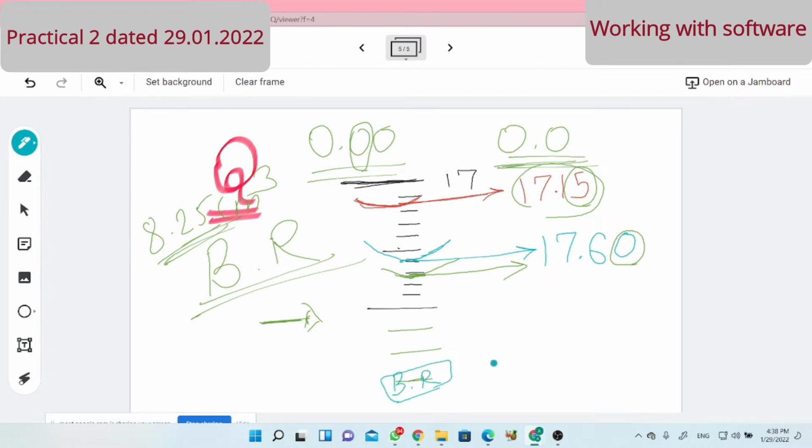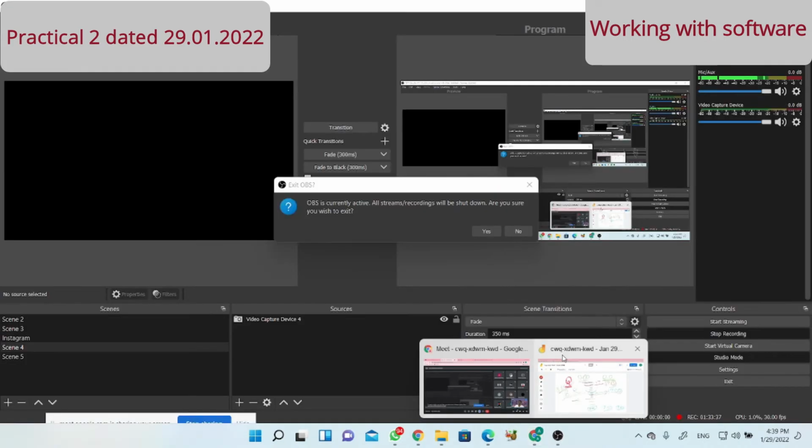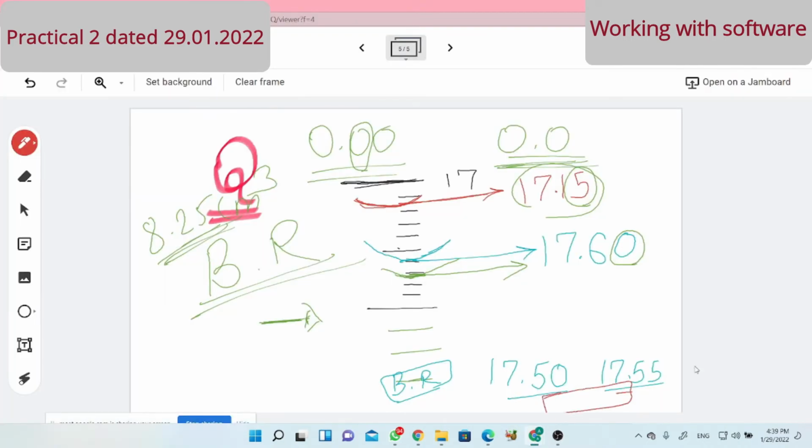If that difference for the student, the difference were 17.3, example, just wait, what was there? Just another example I can take. Say 17.50 as one difference, the actual first reading, and the second reading is 17.55. That software allows such readings. Then below that you have to mention the burette reading. And what is their expectation? You have to take the average of these two numbers.